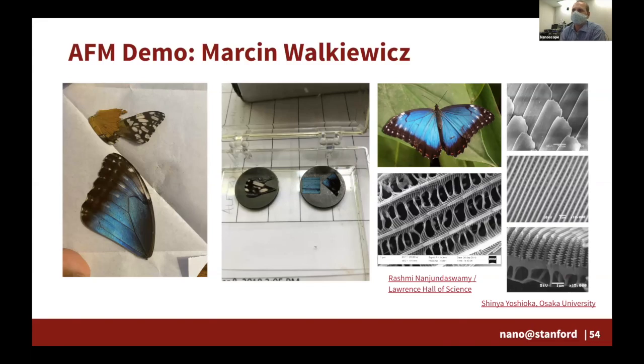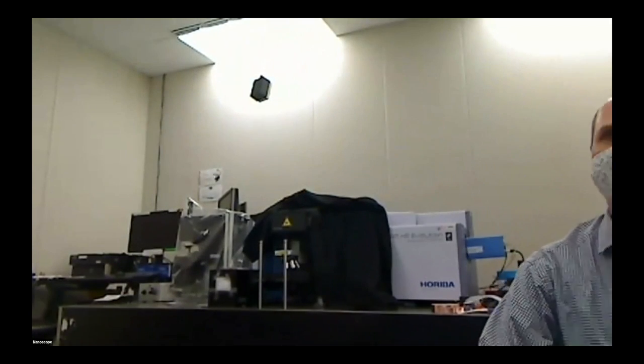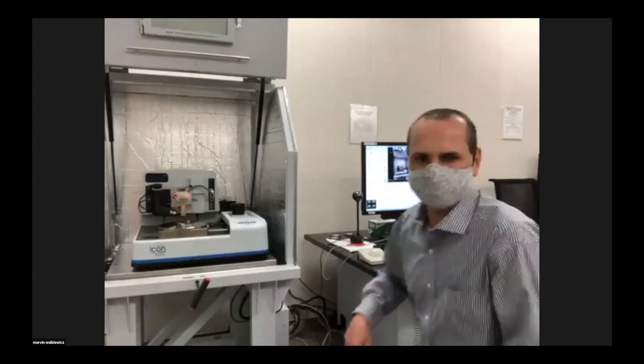So I'm going to hand it back over to Marson. Can you highlight the other video? Yes. The other feed? Yes. Where are you? Oh, here. Okay. All right.